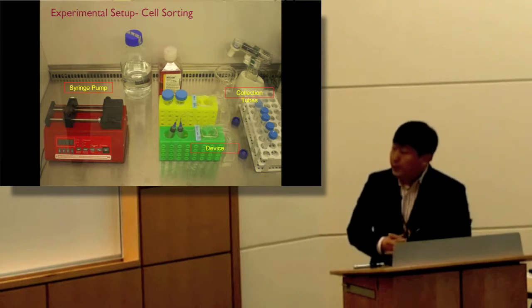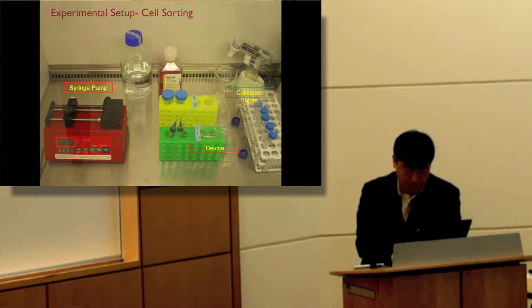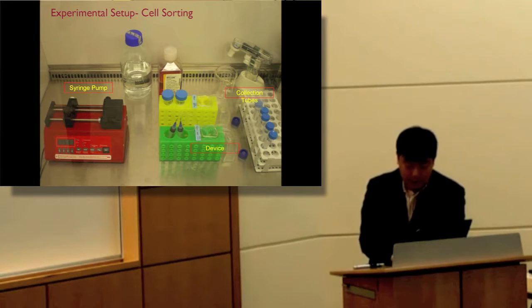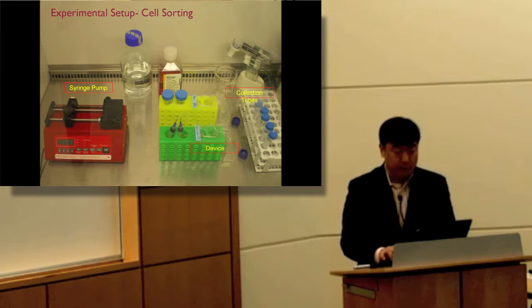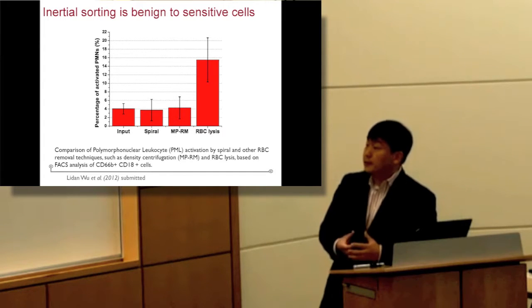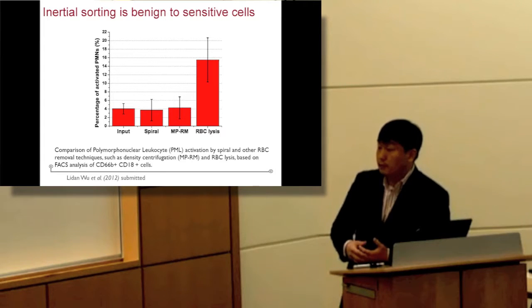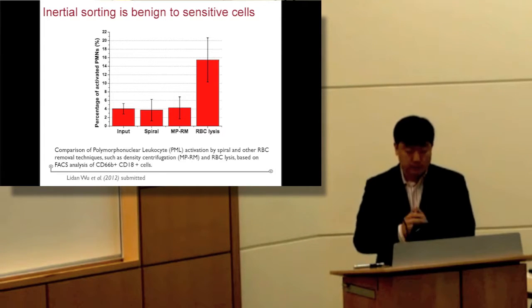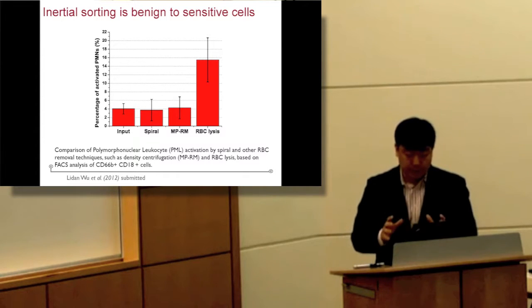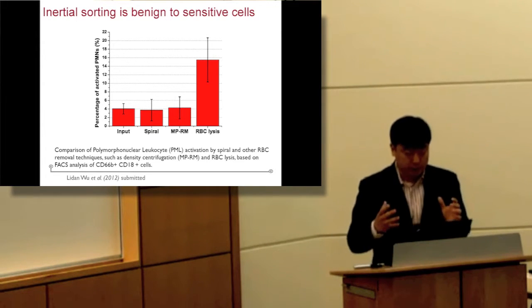But the point that I want to make is that what we have here is a relatively simple device. It's a piece of PDMS, and all we need is a syringe pump to push the cell solution, and we collect the cells in the other tube. With that, we can process many different types of biofluid, including blood and bone marrow aspirate, and potentially peritoneal fluid and others. In most of these biofluid preparations, the problem is that the high content of RBCs needs to be removed, and that's exactly what we can do best.